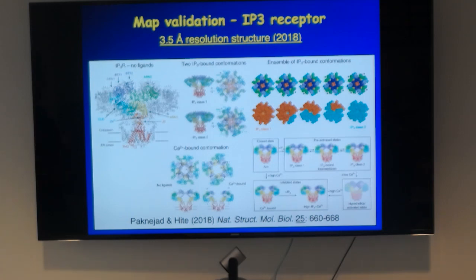I only have one question from the YouTube channel, and this was back when you were talking about the cross-linking and looking at the native versus the cross-linked structure. We have Lolita who's asking, will NMR be applicable for discriminating cross-linked from native state if they are mixed together for some reason?